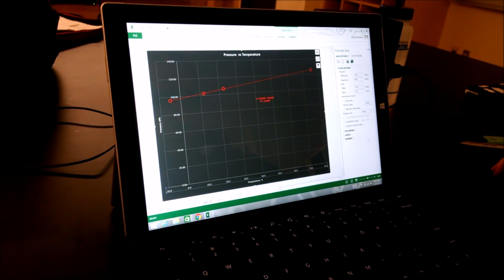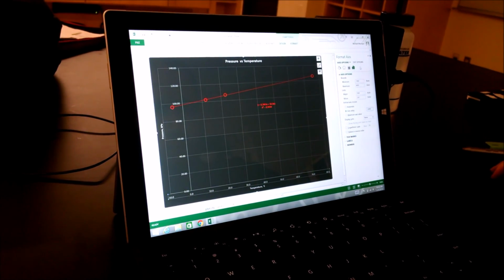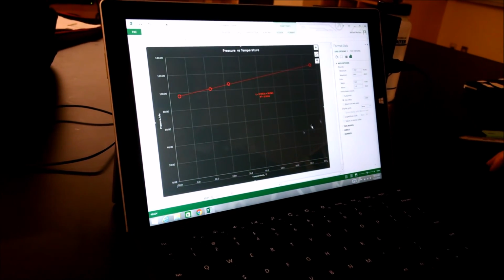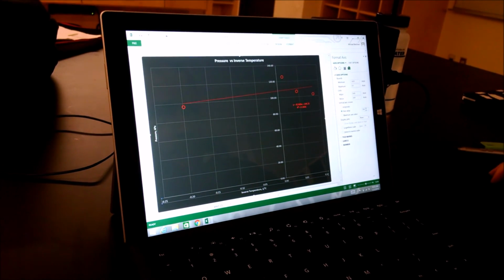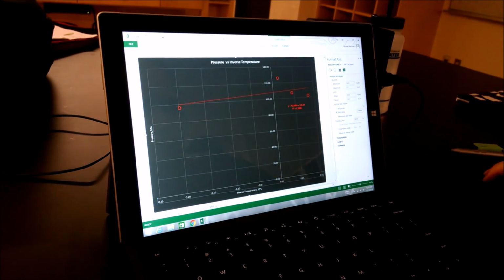And then that should fix it. Does it not fix it? Oh, there it goes. Okay. So it's down on that end. And then a similar thing here. Negative 3,000.